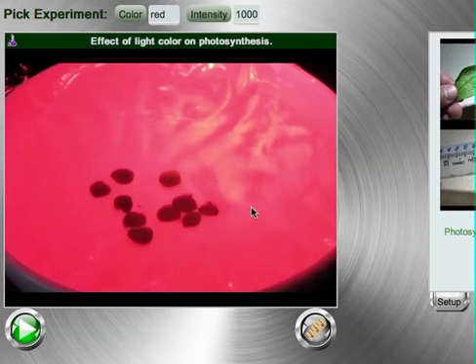The goal of this lab is to watch spinach leaf disks float to the top of a bath of water as they photosynthesize. When the disks photosynthesize, oxygen will build up underneath the disk and cause them to float. When you see the disk float to the top, you will click on it to mark that it has risen.